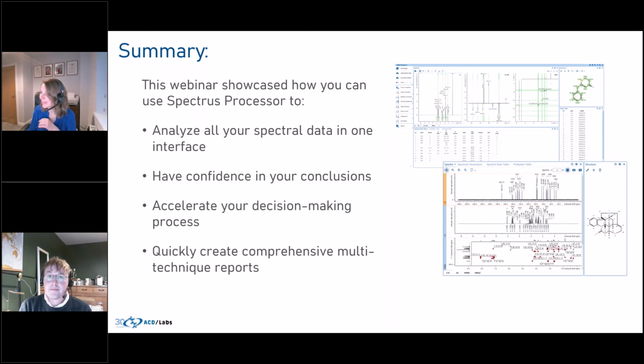What about degradation products? Is there any tool in the software capable of generating in silico degradation products? So you're probably looking at more advanced tools for that kind of thing. We have an auto assignment feature which can fragment a structure and look at degradation products. That would come with MS Workbook Suite. That might not be quite what the question is after. The closest thing we have in terms of generating that would be a software package called MetaSense, which is used for metabolite studies. It would take the structure and predict certain metabolites that could form from that structure, but you can also ask it to predict degradants as well. And then it will look for the presence of those metabolites in your analytical data, your MS2 data.